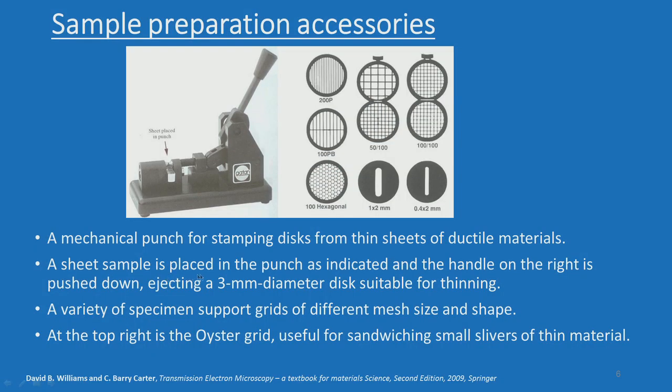We will also show you the actual sample holder and how it is used. A sheet sample is placed in the punch, the handle on the right is pushed down, ejecting a 3 mm diameter disc suitable for thinning. I will show the live demonstration. The reason for 3 mm is that it has to suit the sample holder. A variety of specimen support grids of different mesh size and shape are also available.